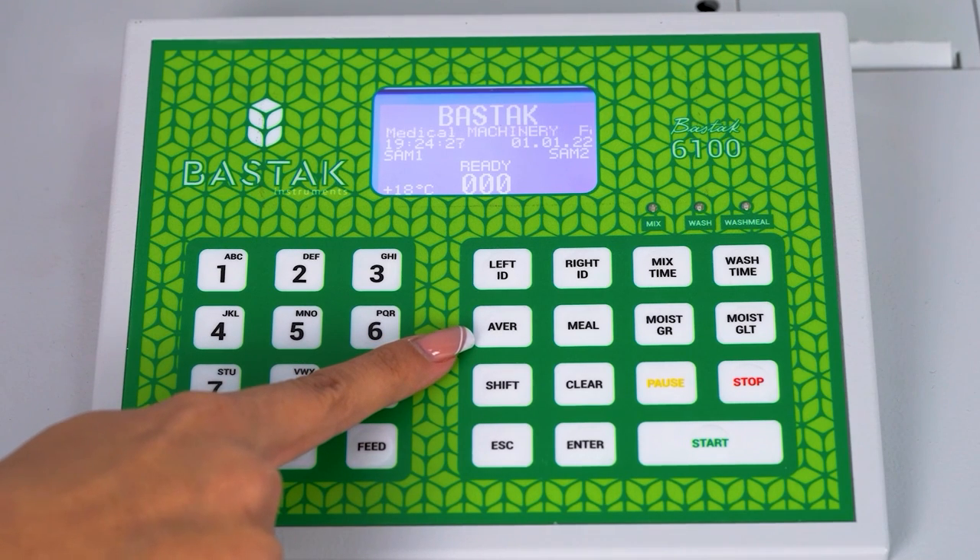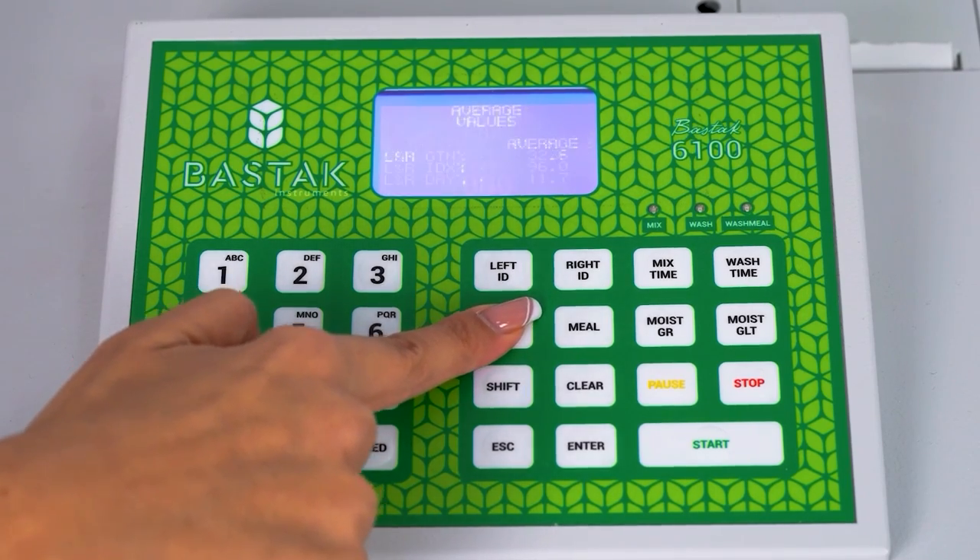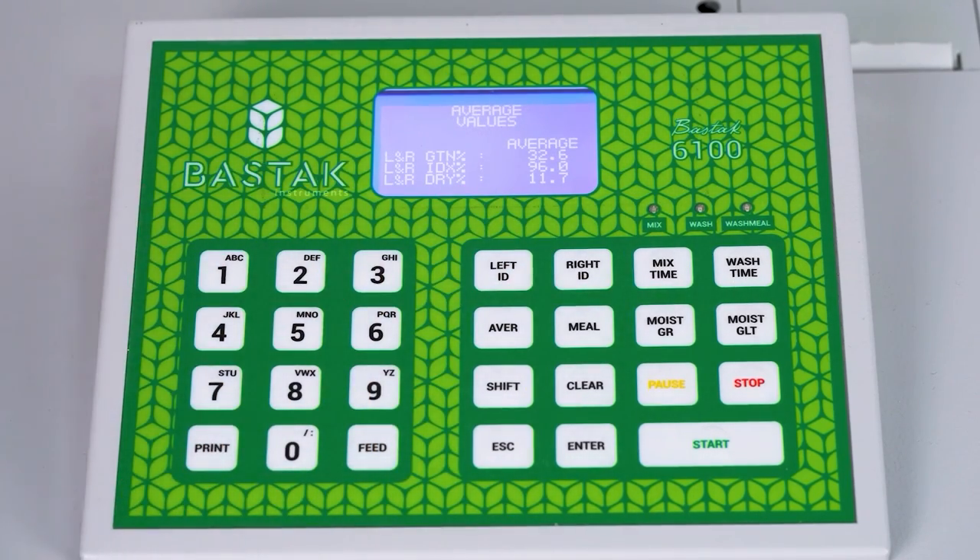When it is desired to take the average of the obtained values, the average values can be seen on the device screen by pressing the average button after the recording process.